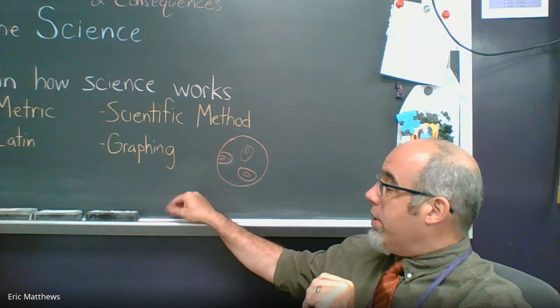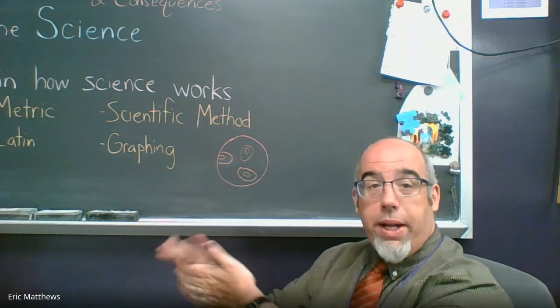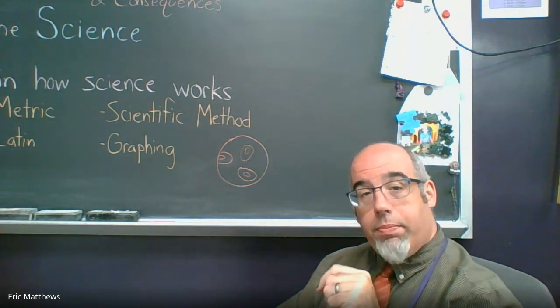So try to remember this. Get your pictures down for low, medium, and high power.